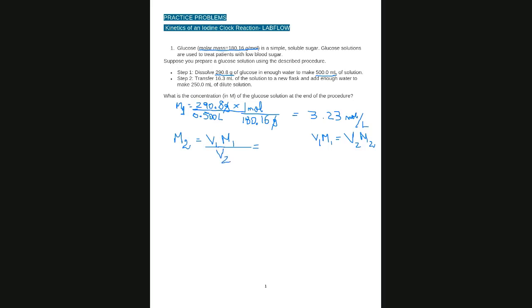So what is the volume 1? Look again, Michael. Volume 1 is the volume that we take from the solution that has the molarity 1.